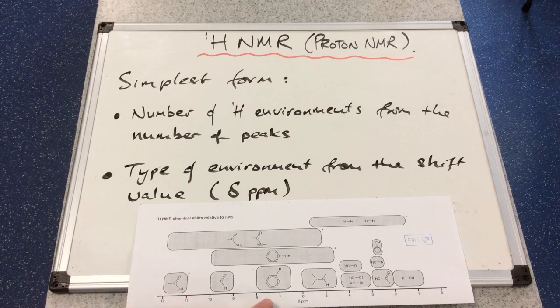So just a quick example, if we see a peak between 6.5 and 8, well, it could be a hydrogen bonded to a benzene, it could be a hydrogen belonging to a phenol, or it could even be, because it continues up here, it could even be this environment here. So this is C double bond O NH2, or C double bond O NH.